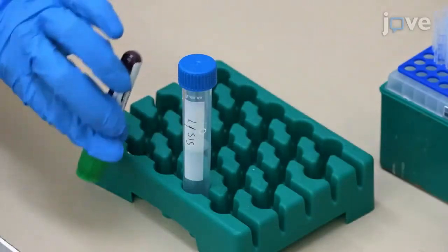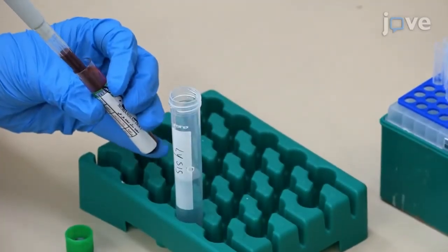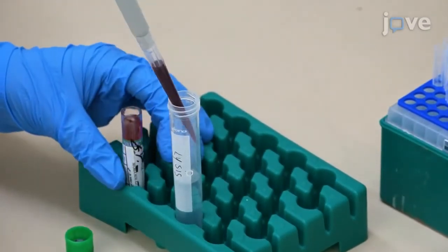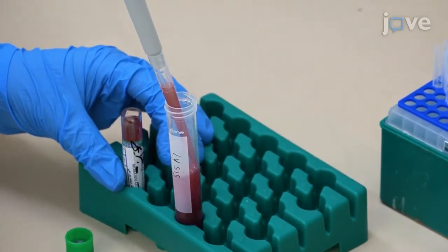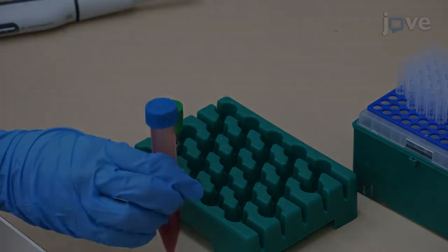For DNA isolation from blood, gently rock the tube until it is thoroughly mixed. Then transfer blood to a sterile 15 milliliter centrifuge tube containing 9 milliliters of cell lysis solution. Invert the tube several times during a 10-minute incubation period.